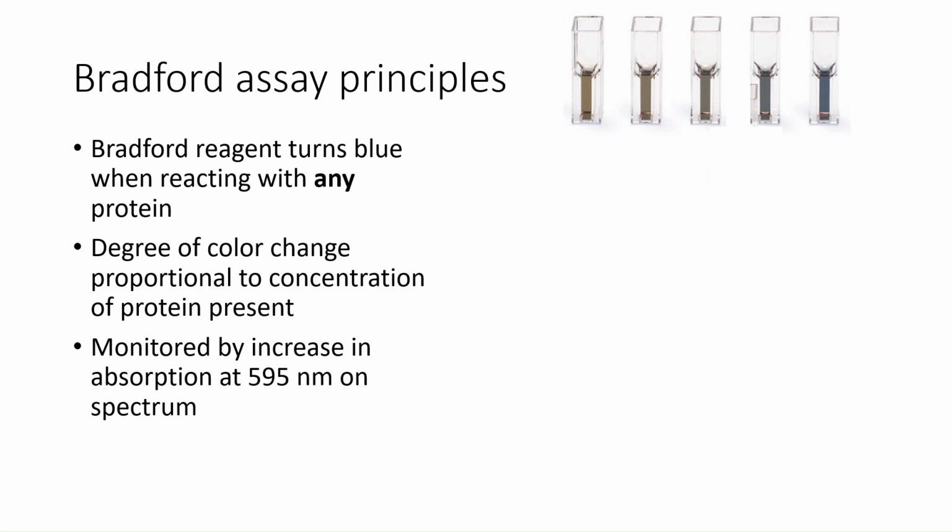So now that we've talked a little bit about measuring volumes with different types of pipettes, let's move on to talking about some of the assays that we'll be doing during this week. So during week 3, we're going to be doing the Bradford assay.